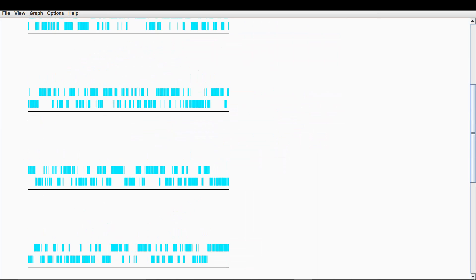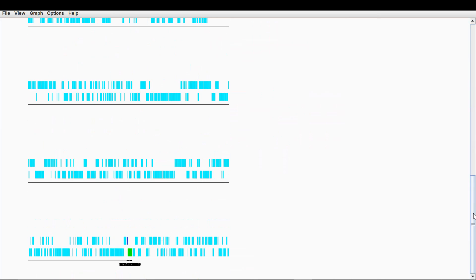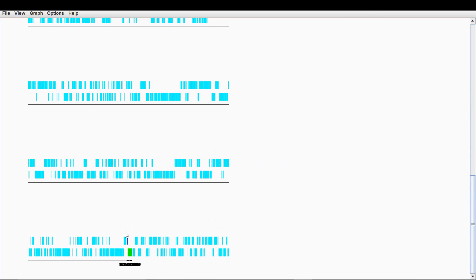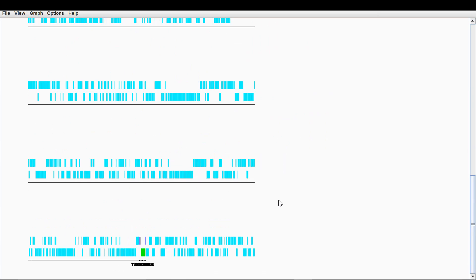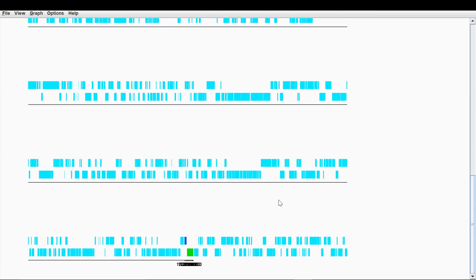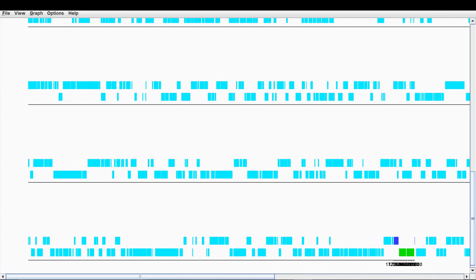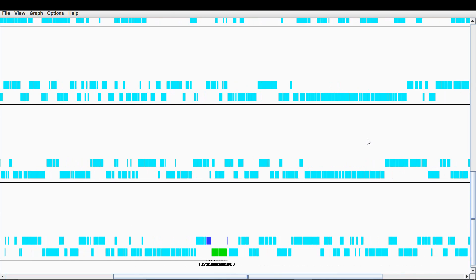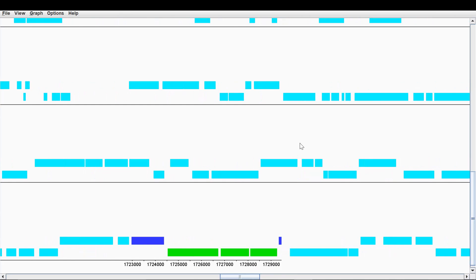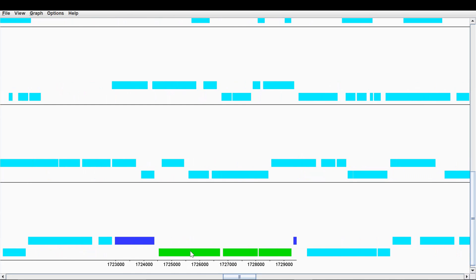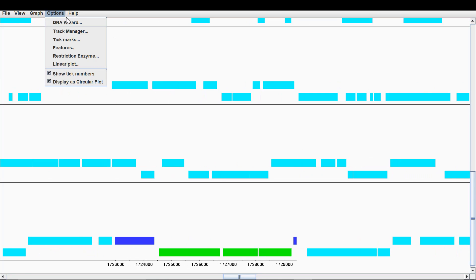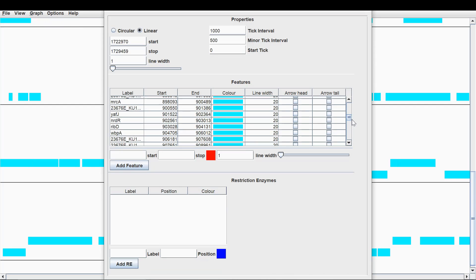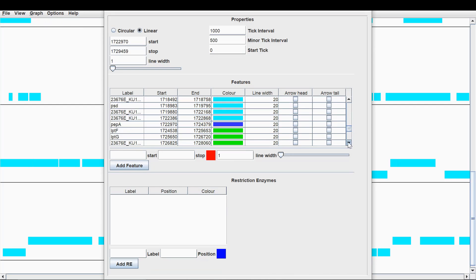You can see you have to do a little bit of formatting at this point, but this is the region we're looking at here. If you press control I, you can actually zoom in to this portion of the genome. So you can see it's starting to take shape here. So another thing you can do at this point, you go back into DNA wizard, edit current DNA display. So locate the region you're looking at again.